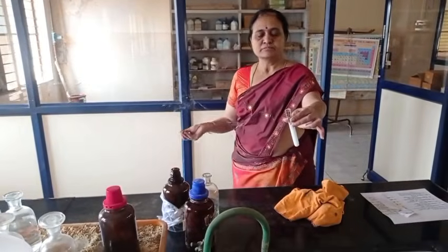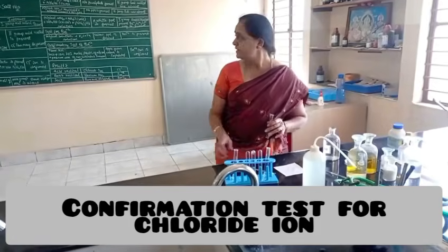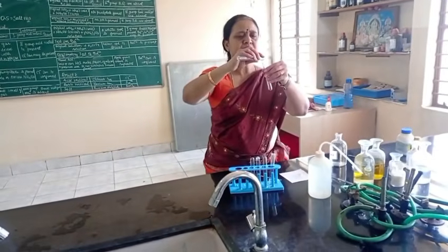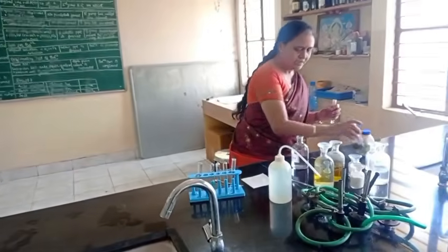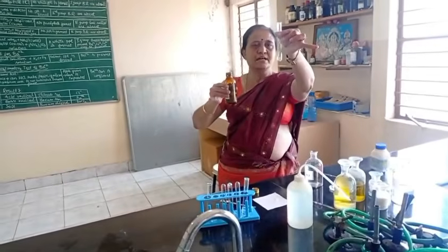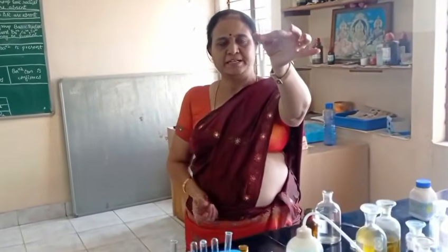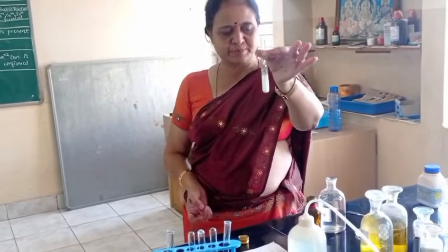So now I will do the confirmative test for chloride ion. For the confirmative test I take salt solution. To this salt solution, I am adding silver nitrate. See here, salt solution plus silver nitrate solution, I am getting a curdy white precipitate.